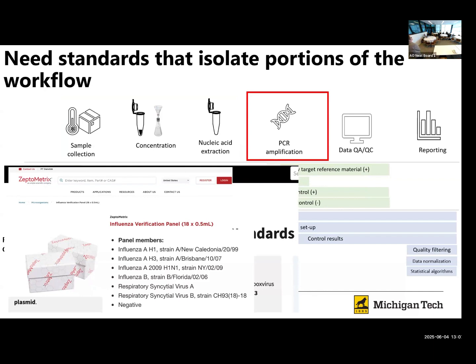All right, you can think about having specific DNA reference material that maybe you're not trying to control for the entire concentration process. You're just trying to make sure your assay is behaving and it's quantifying as it should. And I would recommend, even with digital PCR, that you should always have a standard included on your plate so that you know your recovery every time, and you know, did everything go well?